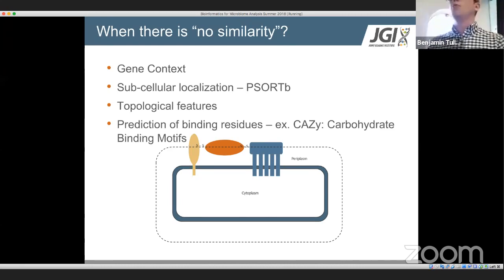If everything is different, what can you do in terms of looking at the structures of the matches that they're telling you are matches? What can you do on your own, looking at alignments, looking at trees to see if that makes sense? If you don't like making trees, looking for really high specific confidence in your functionality is going to get really tedious for you, because it's going to be a lot of tree making, a lot of alignments, and a lot of confirming results that you really hope would just be done automatically. But the more confident that you want to be, or the more of a stand you want to take on a particular function, the more effort you're going to need to put into proving that through various other methods than just, I put it in a pipeline and this is the result that came out.